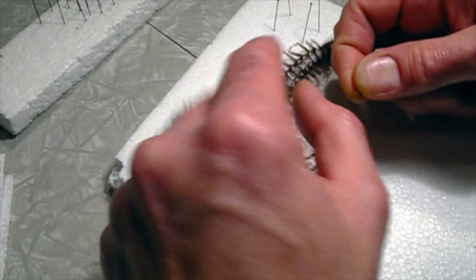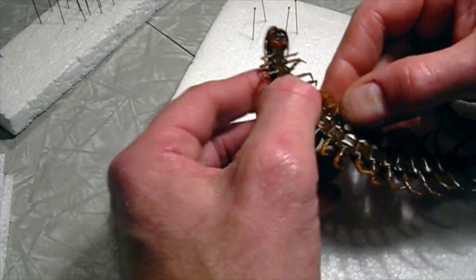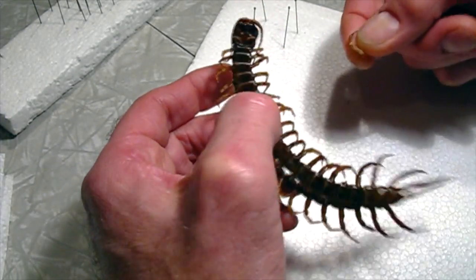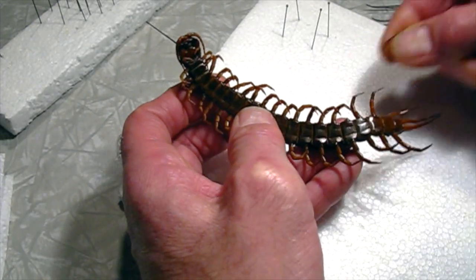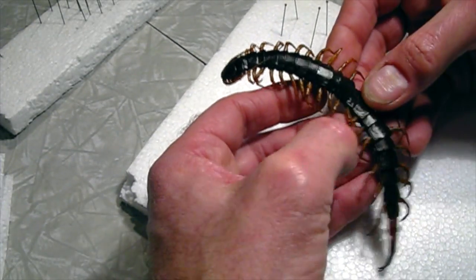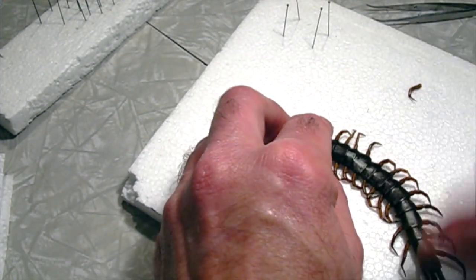I did pull one leg off. These are fairly sturdy and well attached, so I was able to pull on them pretty hard, but this one came off from right here. I can glue that back on. It's best, of course, not to pull them off. And you can see that helped a lot. It got the legs more out in the position where we want them.